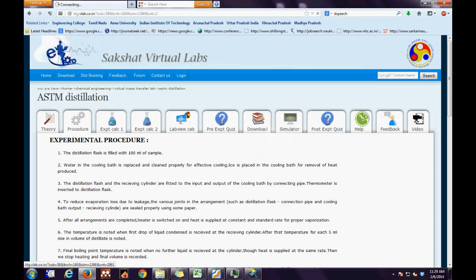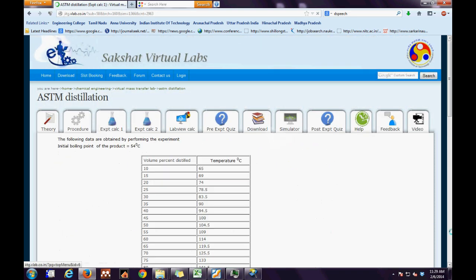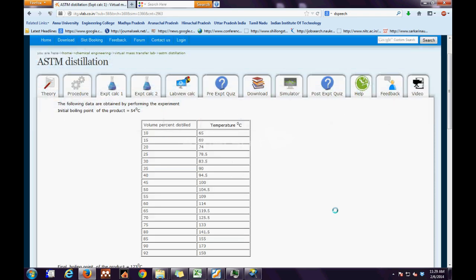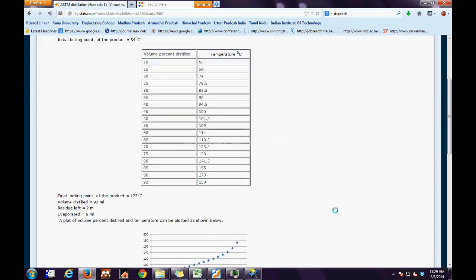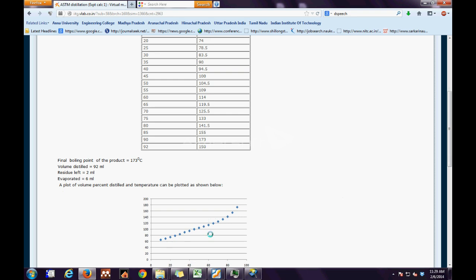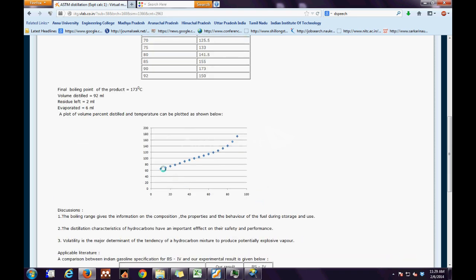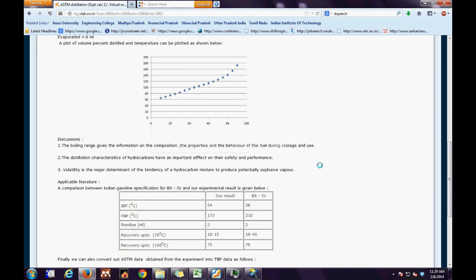The third tab is the experimental calculation tab. The data obtained from the experiment for initial boiling point for a particular volume percent distilled has been shown in the table. Further, a plot of volume percent distilled and temperature has been plotted as shown in the graph. Depending on this, the final boiling point, volume distilled, residue left, and amount evaporated have been evaluated.